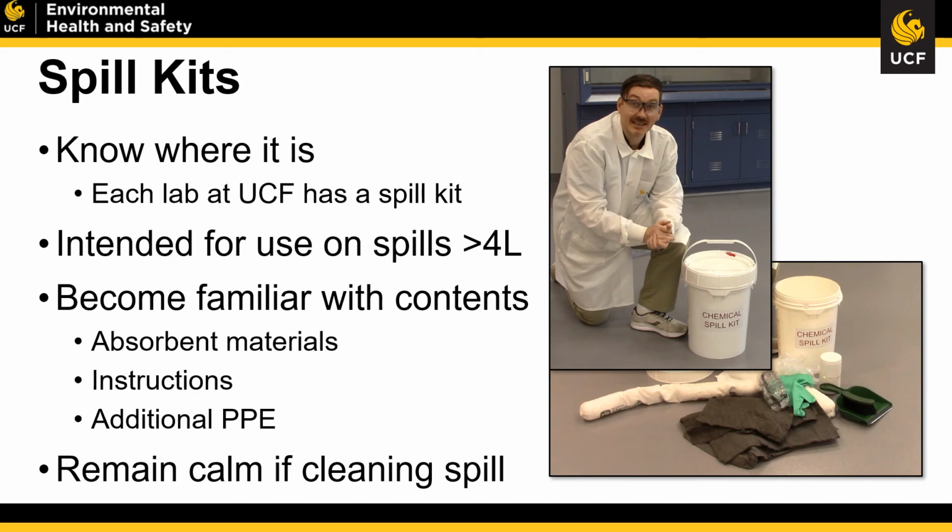In the event you do need to use the spill kit, it is a one-time use spill kit, so use it, bag it, label it with the appropriate hazardous material, and let the Environmental Health and Safety Department know that you've had a 4-liter or greater spill and used the spill kit to contain it. That way you can put in a waste request and have a pickup occur, and we can supply you with a new spill kit.